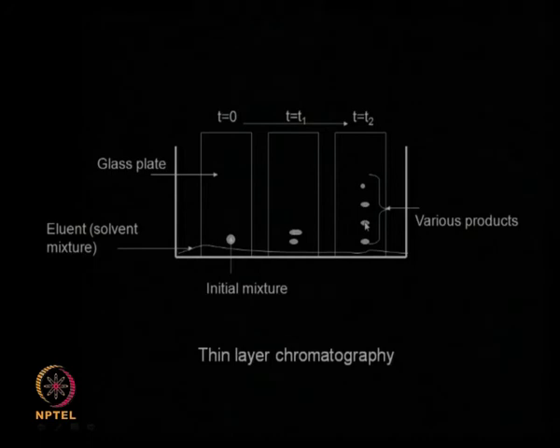So, you could say each one of them is a product. You have to play around with the solvent mixture so that you get good separation of the spots. This is called thin layer chromatography, it is so simple.